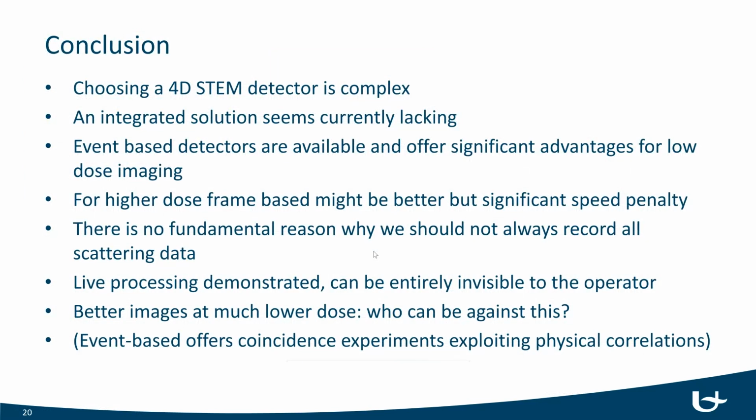And so there is really no need to not record 4D STEM all the time. The technology is now at a point where in principle you can have a microscope where all your STEM-based work is always recording the diffraction pattern for every probe position. The only caveat for the event-based is that this only works at low enough beam current because otherwise the camera can't handle the events.